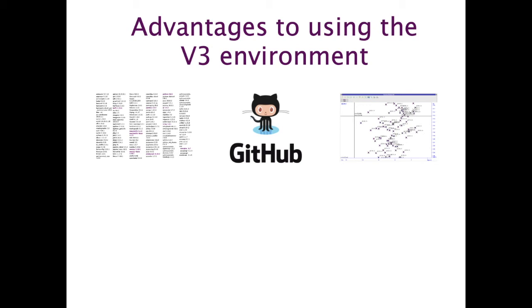So these are some of the advantages to you as a developer. There are also a number of advantages to your users. So we've got hundreds of users right across the globe, and obviously for them it's very convenient if they can install your software simply by clicking on our updates button.